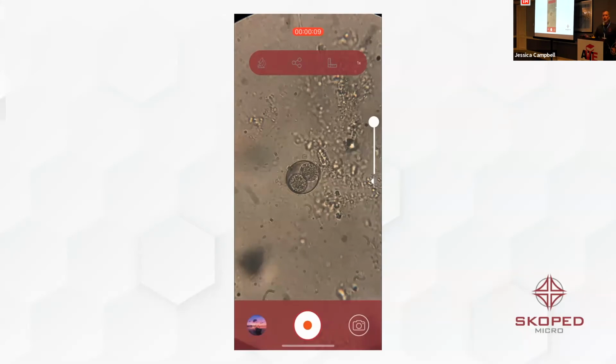Okay. We've got a virtual question. There's one person out there. Great question. The question was, can this system be used with a compound scope and a dissecting scope? So yes, it can be used on any microscope. They all have 23 or 30 millimeter eyepieces. Matter of fact, the one with the worms was on the type of scope you're describing. Really, we can make something for anything that has an eyepiece. So if you had the weirdest thing ever and you can't fit, you send us how it works and we'll make you one.